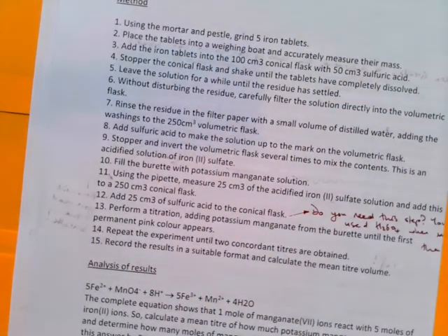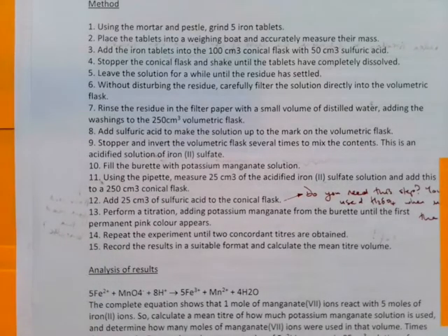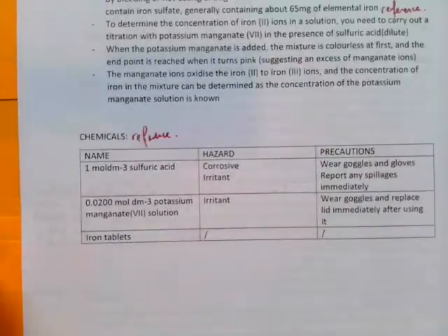So everyone be aware of that, because I can well imagine that we'd be in the lab, and then all of a sudden when it comes to reading off the burette, everyone's saying, well, hold on a second, I can't actually see the meniscus, what do I do? So you need to make sure you know about that. Okay, then moving on.